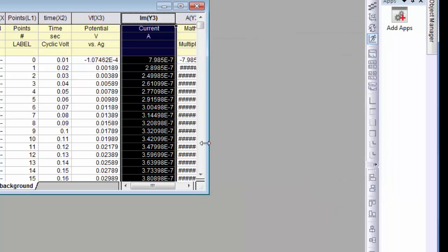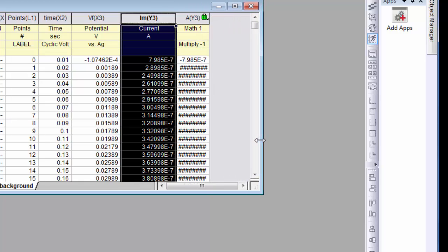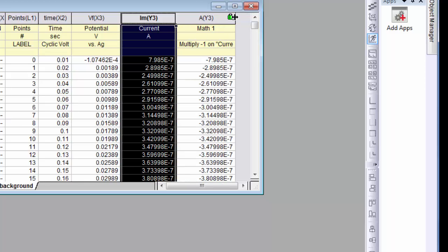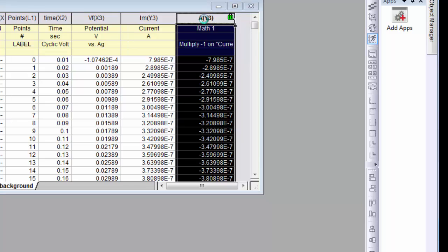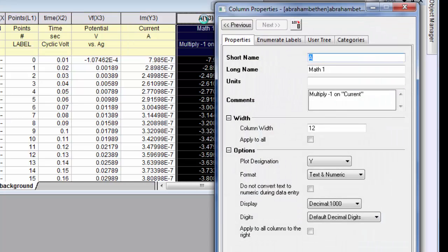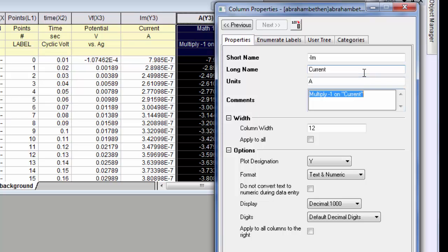So here's our new column. Let's widen it up here. Let's call this the corrected current. So it's still amps and this is corrected.